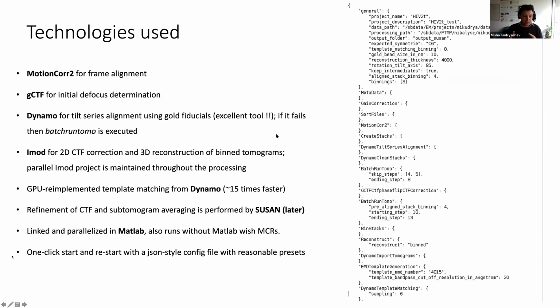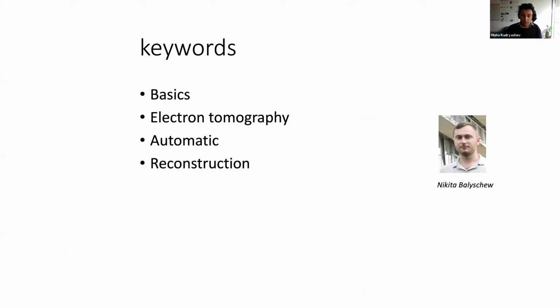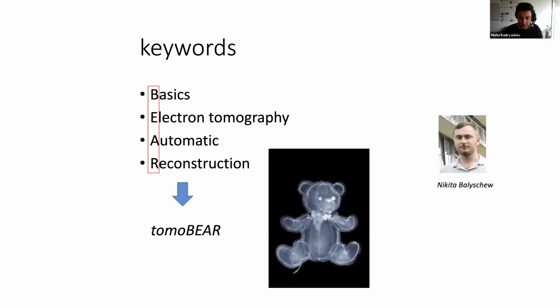So it's essentially a combination of several different tools that are all brought to the same input-output formats, with the potential to actually record what the person has been doing with the data. It's written in MATLAB, but it also runs without MATLAB. So essentially, you don't need a MATLAB license if you want to run it on, let's say, a cluster. Okay, so these are the keywords that we came up with, and we decided that it has to be a tomo bear. So we call it this way from now on.